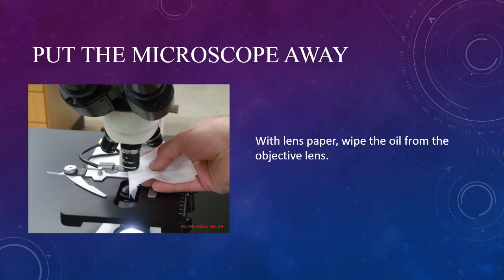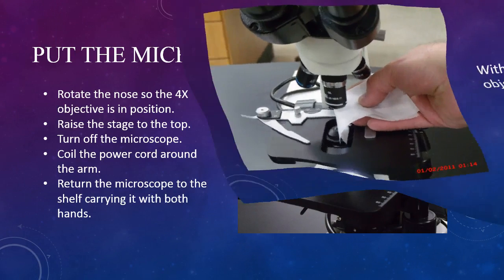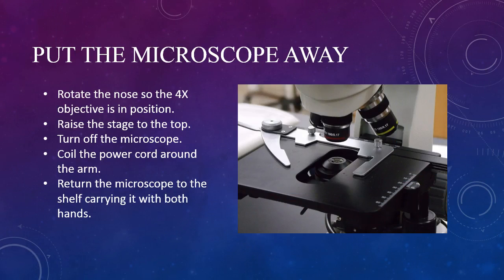Use lens paper to clean the oil from the objective lens. It is important that you use only lens paper to do this — paper towels and even kim wipes are too abrasive and could scratch the lens. Once the 100x objective is clean, rotate the 4x objective into the viewing position.